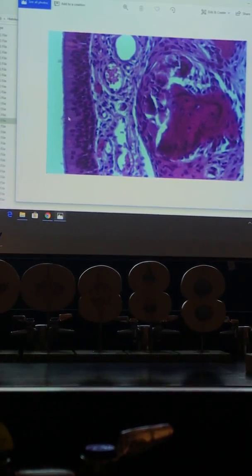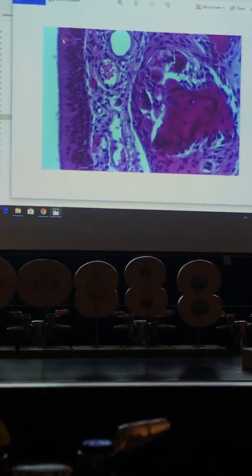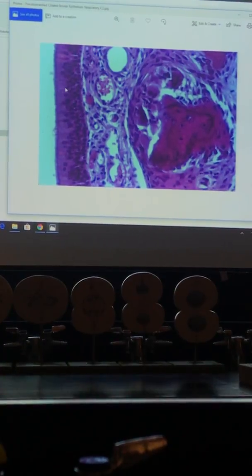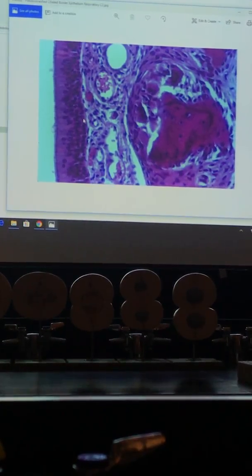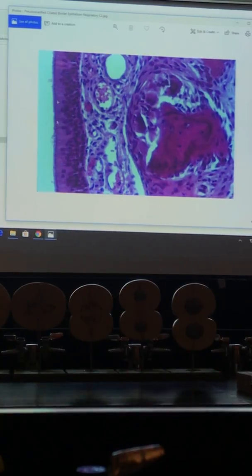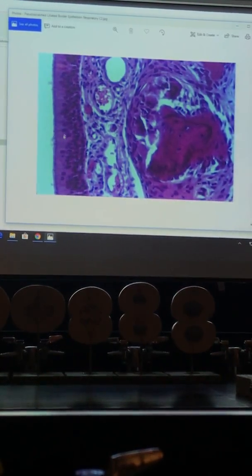So this is obviously an acid stain. It's pinkish. So when you look at this, you can see this weird layering. Every cell has a connection to this basal lamina. I told you I wouldn't ask you lamina lucida or lamina densa, and I won't. But I will ask you this tissue type specifically, which is pseudostratified, ciliated columnar epithelium.